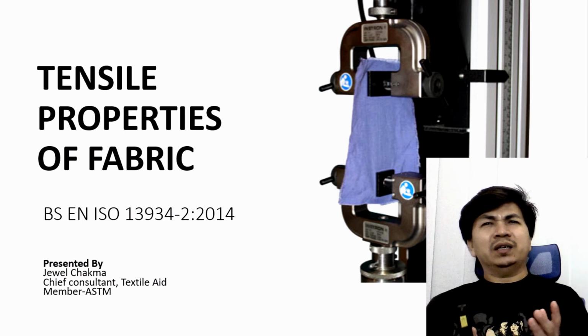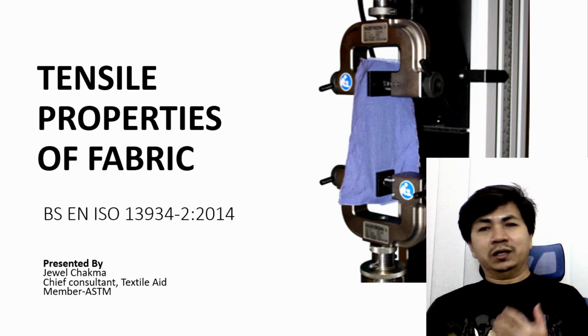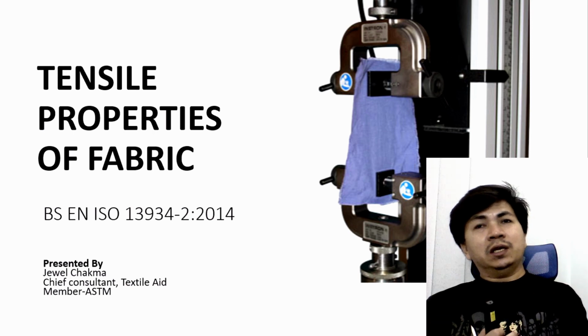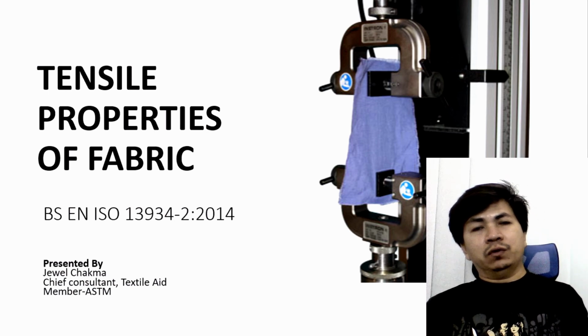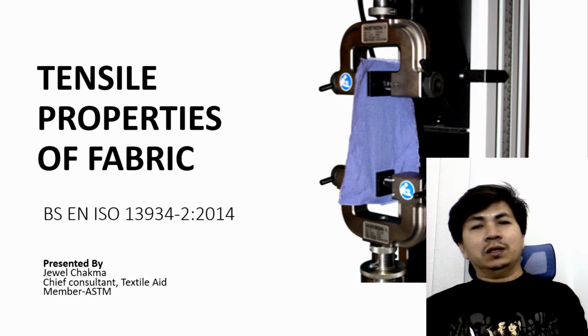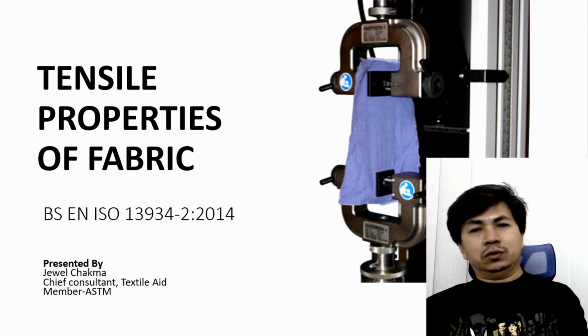There are many international standards for conducting this test, such as BS EN ISO 13934 part 1, BS EN ISO 13934 part 2, ASTM D5034, and ASTM D5035. So there are many methods, but basically there are two types of method for conducting this test. One is the grab method and another one is the strip method.